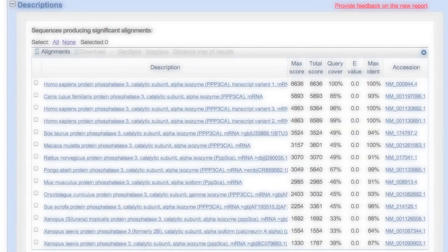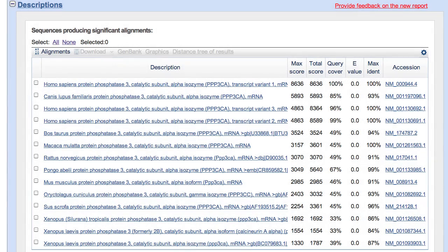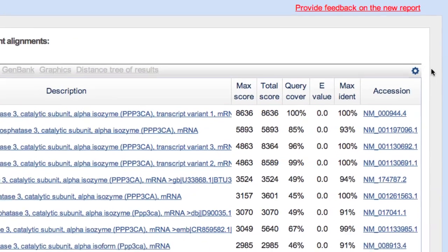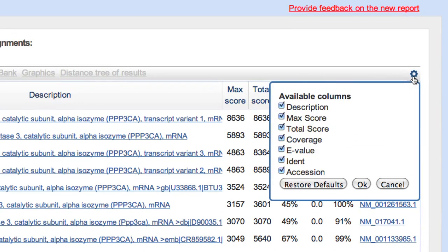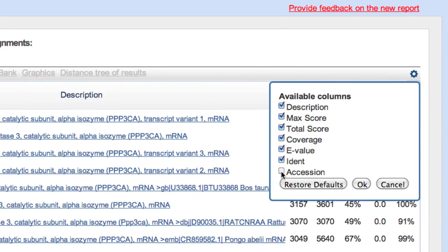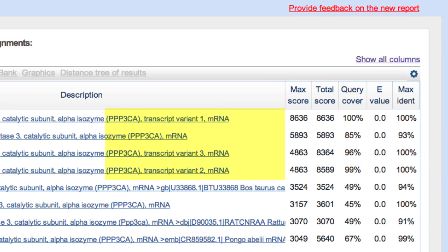Let's take a look at the new description section. First, note that more of the description, or definition line, is available. In addition, this table can be customized to remove columns you may not need. Use the gear icon to make your selections. For example, after removing the accessions, you can now see which transcript variants were found.